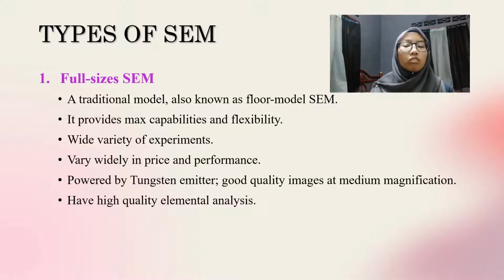It also covers a wide variety of experiments, but it varies widely in price and performance. Full size SEM is powered by tungsten emitter, and it can create good quality images at medium magnification. They also have high quality elemental analysis.